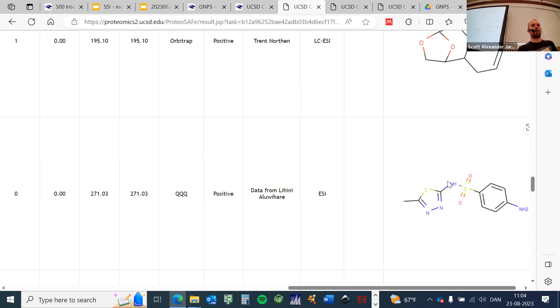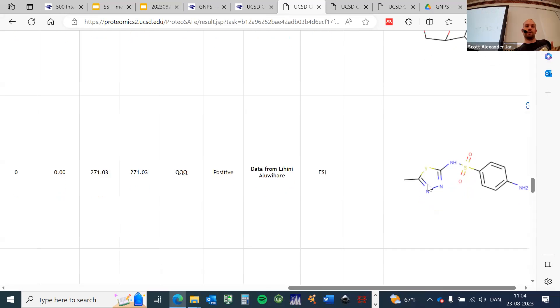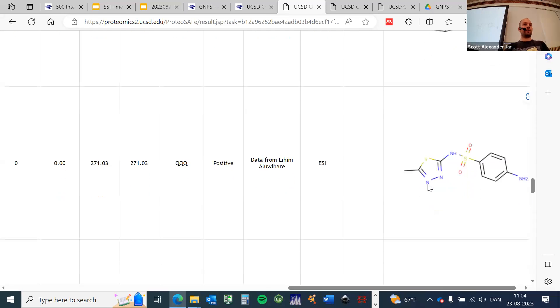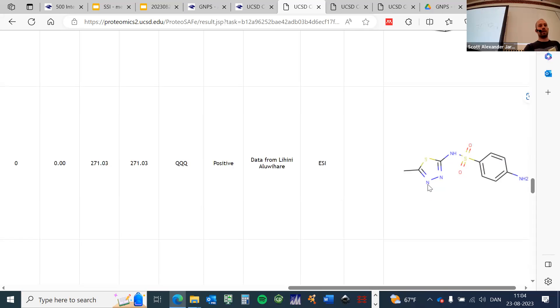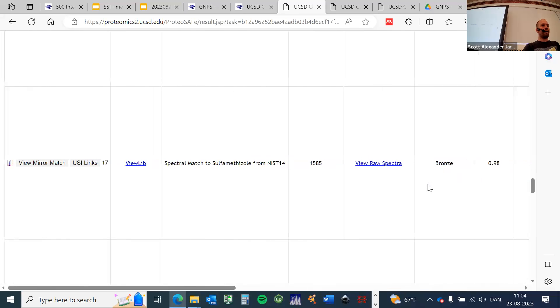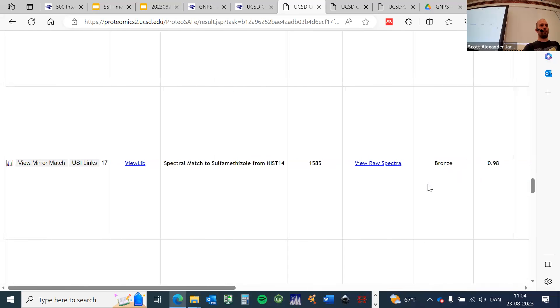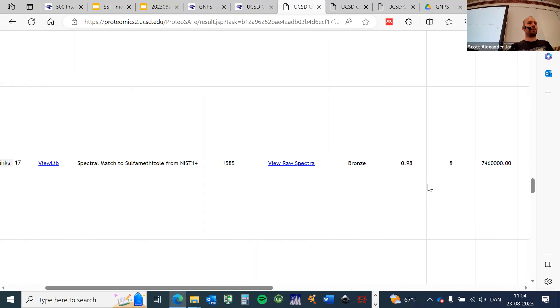For me as an MD, they just indicate basically the different atoms, right? It makes it easier to see, this is a nitrogen or a sulfur. A lot of my research deals with antibiotics, and when I see a molecule like this I'm getting interested, not necessarily because this is a new natural product but rather because this is an important antibiotic sulfonamide. Then I would further inspect what else is connected to here, and that brings me to the second view I typically go to right after the library IDs.